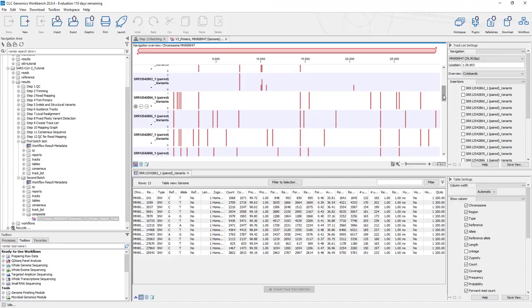So we'll stop right here, and the next time what we're going to do is I'm going to show you how to use the collect and distribute to collect your consensus sequences into one file, and then it may take more than one video, but bring in a workflow to then filter those consensus sequences for those that could be shared with GISAID or GenBank, etc.